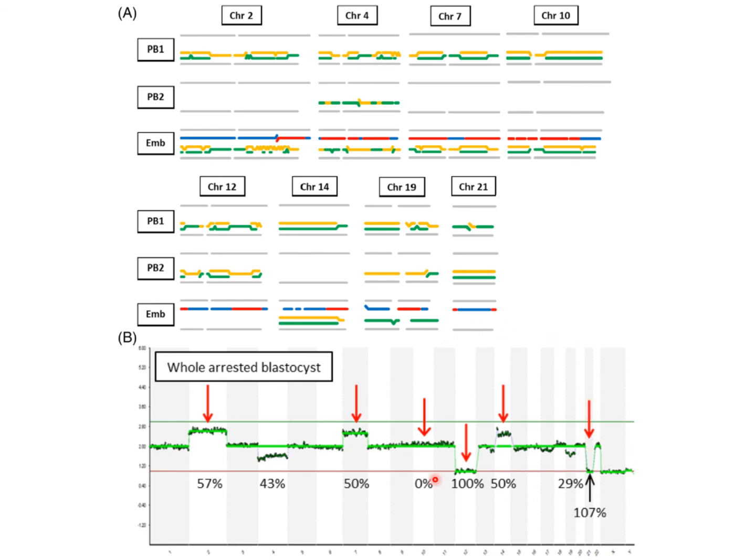So if I indicate on this copy number profile which are the meiotic changes, you can see that there's considerable variation in the displacement, and it may be partly because there are so many changes in this sample that the software has a problem deciding where copy number 2 should actually be. So you can see all of these changes.